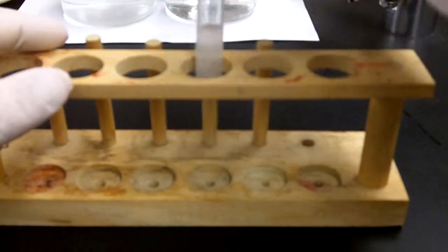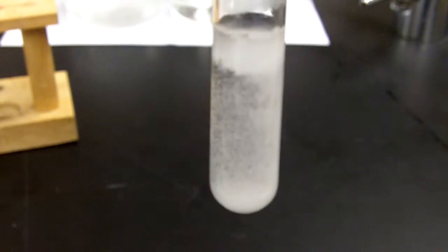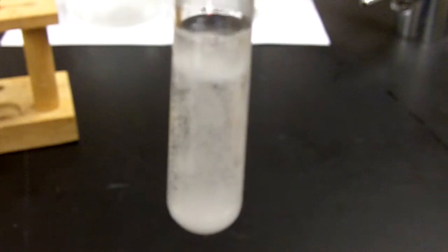Taking a closer look, looks like we have an almost snowy effect. It looks like a white precipitate has formed upon the addition of the HCl.